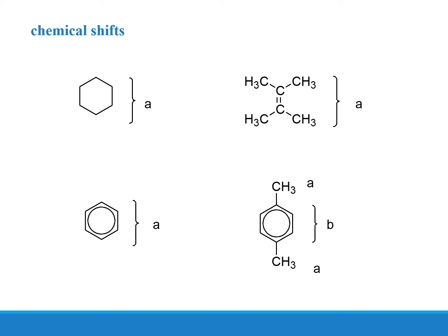from the double bond. Okay, but try also to see here that when we talk about proton NMR, we only refer to the carbons that have hydrogen atoms. In fact, you can also take the carbon that does not have hydrogen atoms as a reference to estimate the environment of the hydrogen atoms in there.